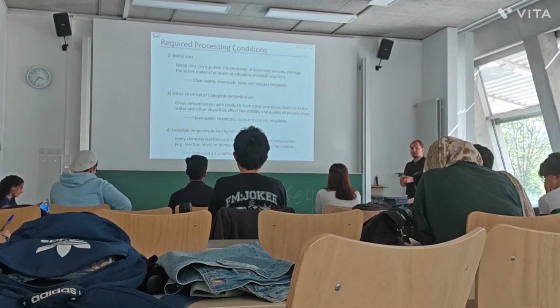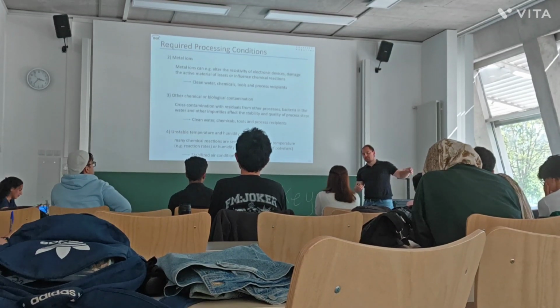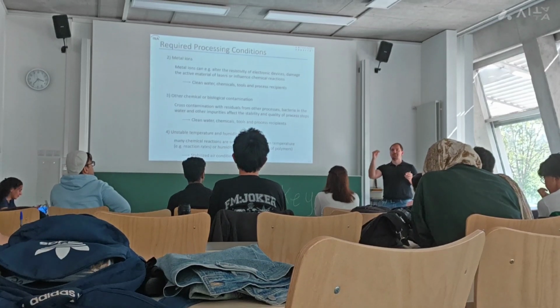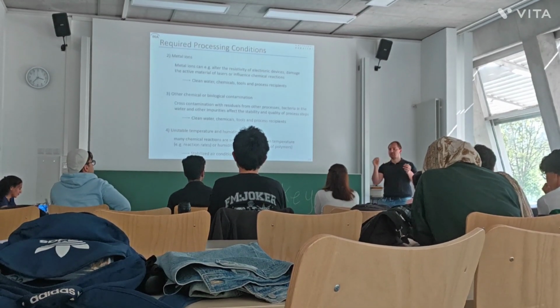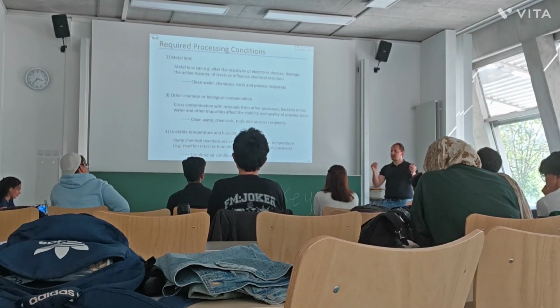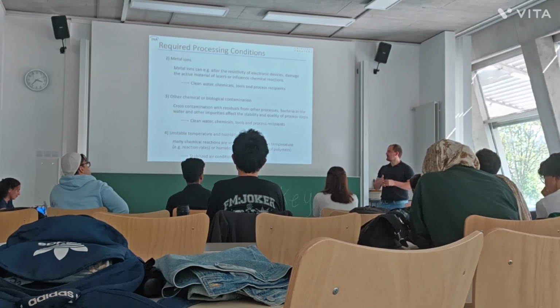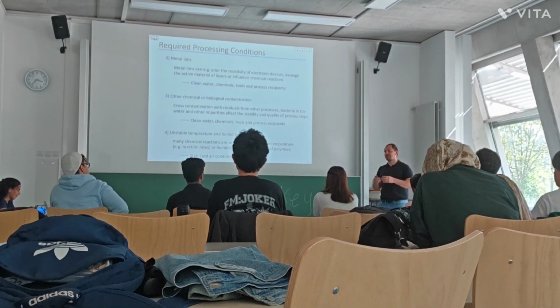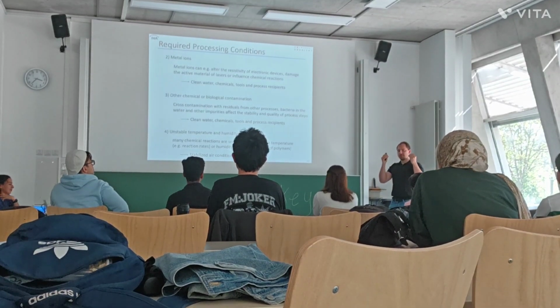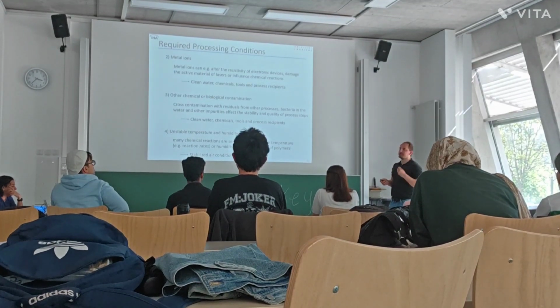That's why when you enter our lab, and I think most of you saw it in the meantime, you have 3 control panels. You can see the current temperature in the lab, so you can write down in your logbook what the temperature in the lab was today. You can write down the humidity, and see the resistance of the DI water, so if it's really deionized or not. So we measure the resistance, and with that you can know whether your process preconditions are really fulfilled, so you can start the process.